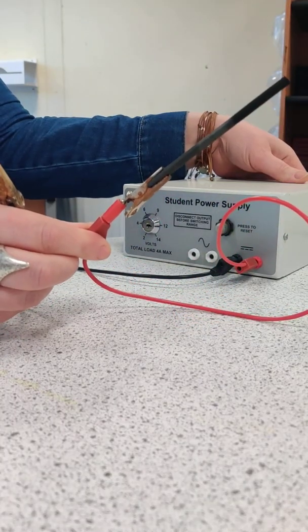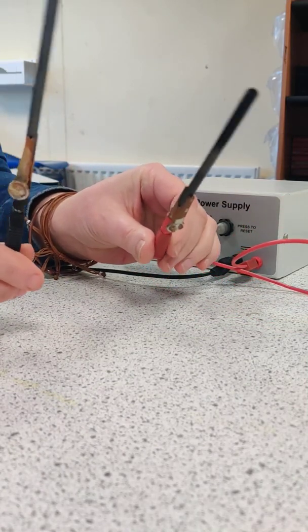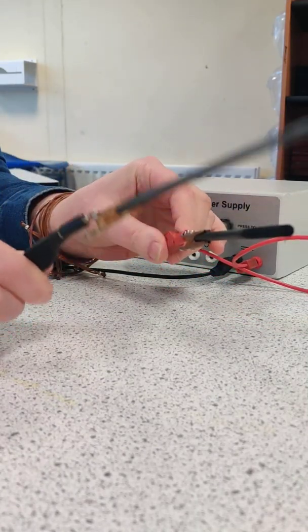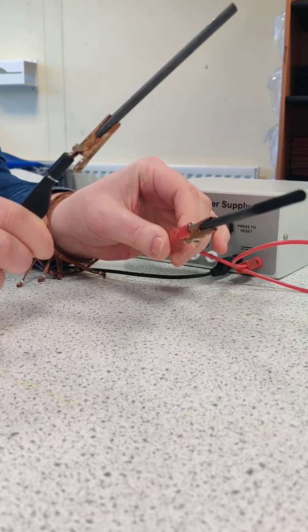When I switch the power supply on you can see that if I touch the electrodes together the current is definitely flowing — you can see that because of the sparks that form.